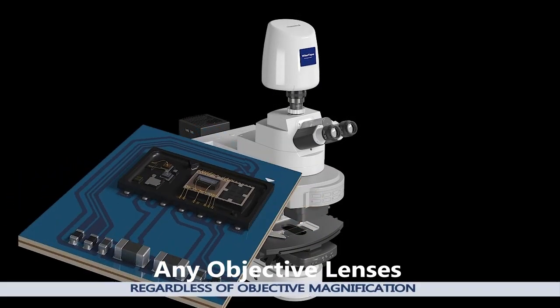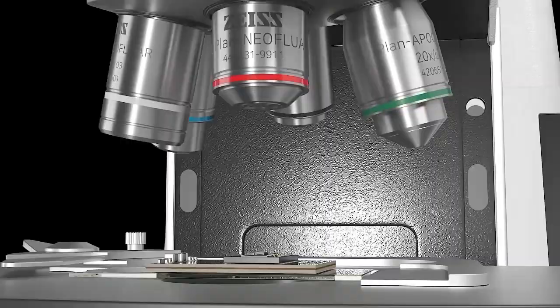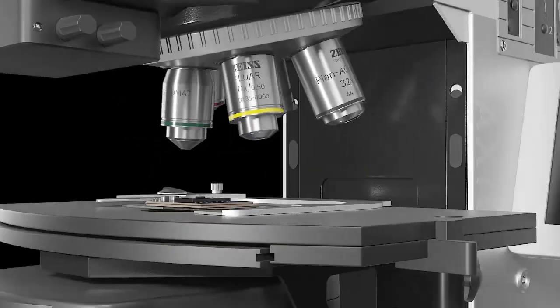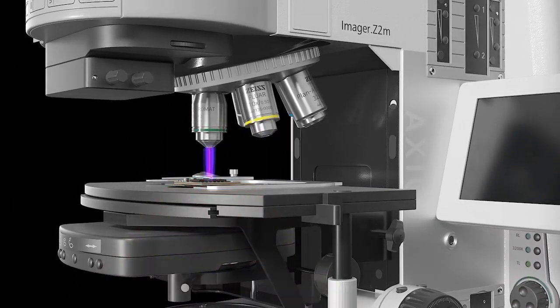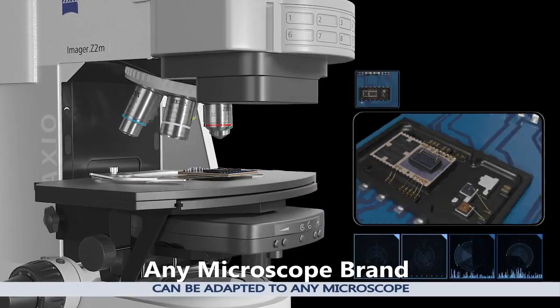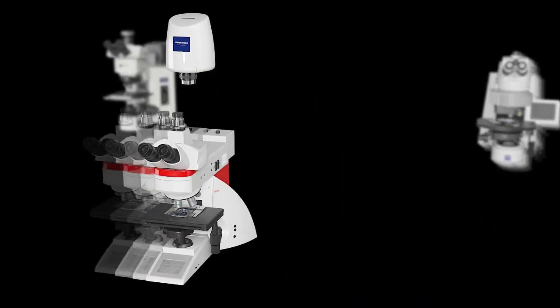In the microscope, objective lenses with different magnifications are mounted on the turret. Wisetopo provides all functions even when the magnification is changed. Wisetopo provides all 3D features in any microscope and can be used with all of them regardless of the brand.